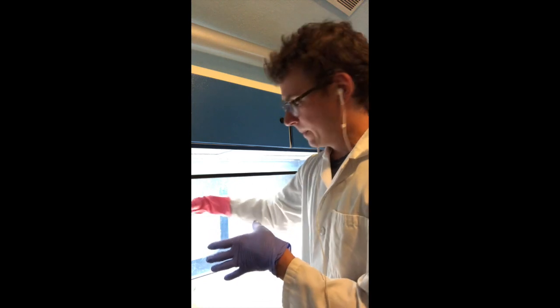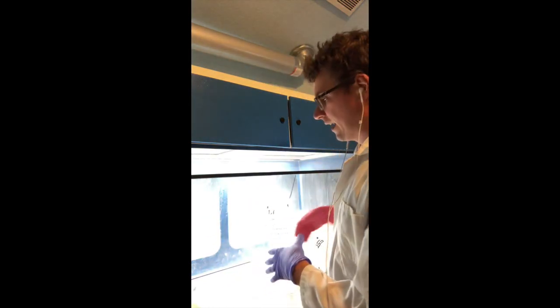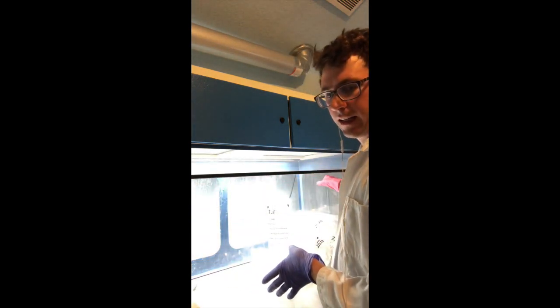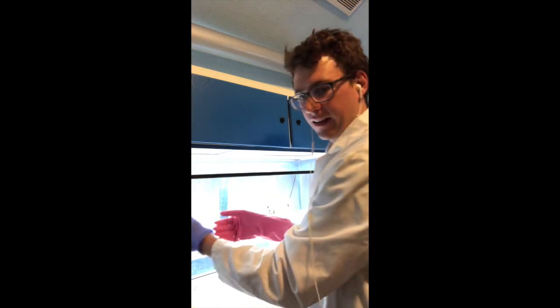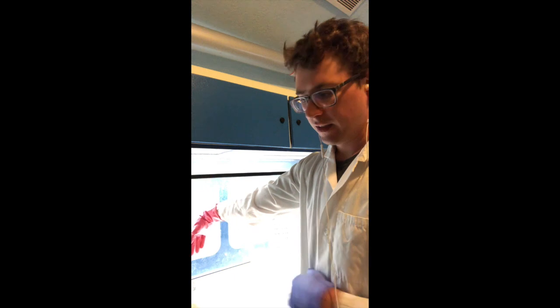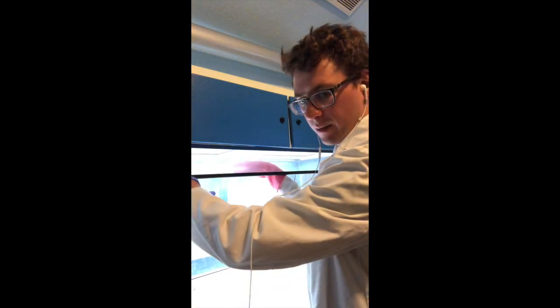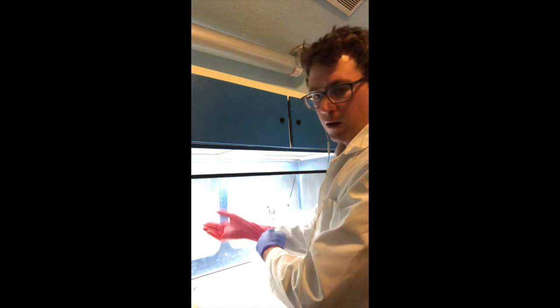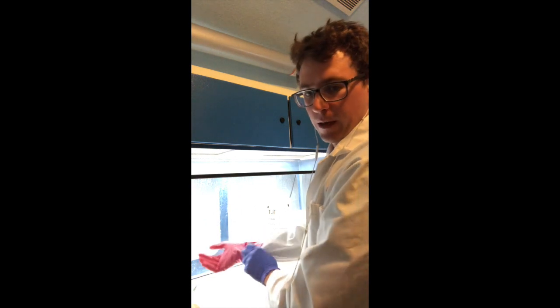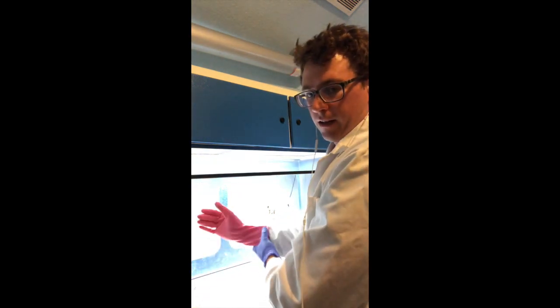And we're gonna be stacking the plates along the back and then in one solid line, pouring that line and then stacking the next row forward. So you're never reaching over a sterile plate. The air is flowing from the top to the bottom. So I'm just always aware of any open skin, which these gloves help to protect, the edge of the lab coat here.